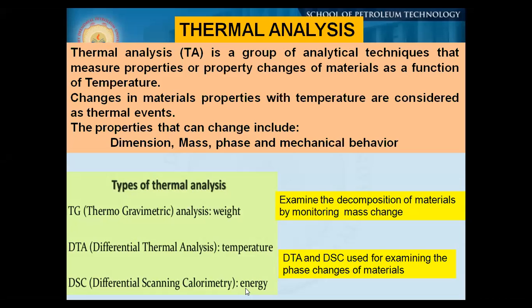We have already discussed thermal analysis, particularly the thermogravimetric analysis, in the last class. So today I will just give a brief introduction to what thermal analysis is, and then we will go to DTA, differential thermal analysis, and particularly the DSC.